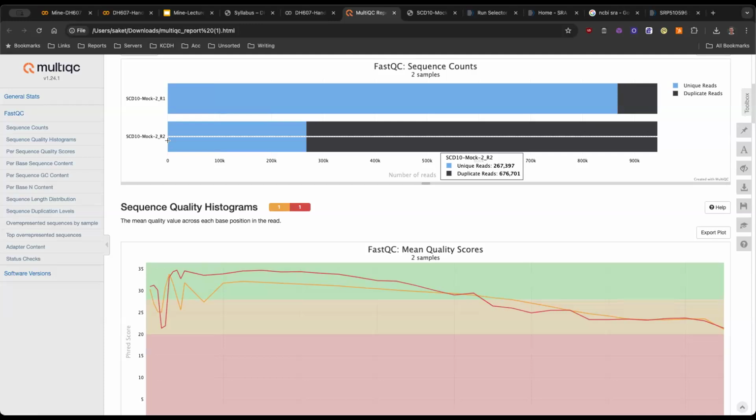This was a huge problem around 2009, 10, 11, when this technology was just maturing. I think we are mature enough now that we don't have to worry about sequencing technology generally, unless you're doing this in the lab for the first time. That's when you'll do this kind of check.